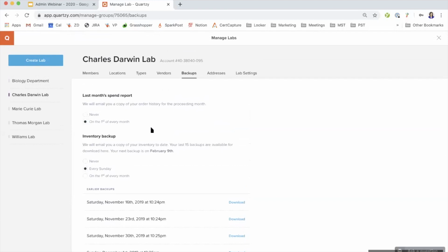No problem. There's one more about the grid from Zach asking if the frozen bacterial stock grid is searchable.